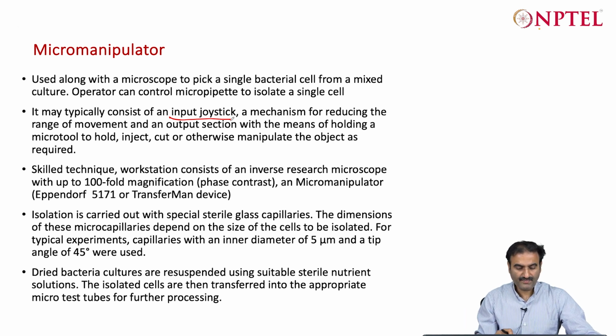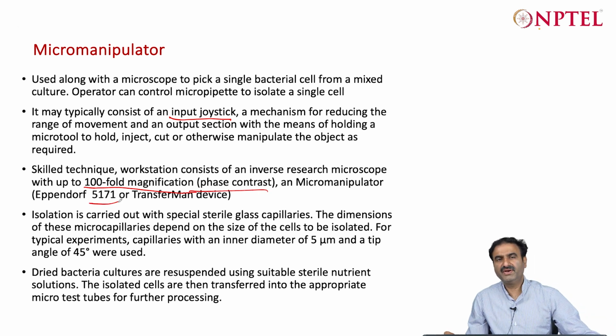Okay. So a microscope is needed, under which you can see. A 100-fold magnification phase contrast microscope is generally needed, and the micromanipulator model is given just as one example, but there could be more sophisticated micromanipulators also. Okay.